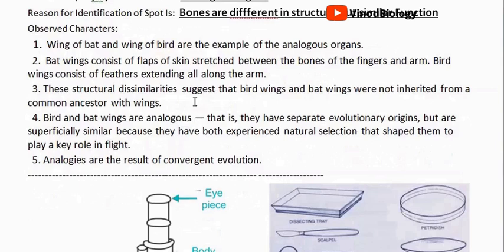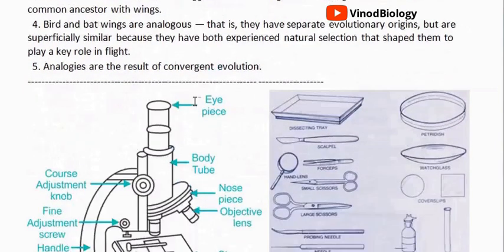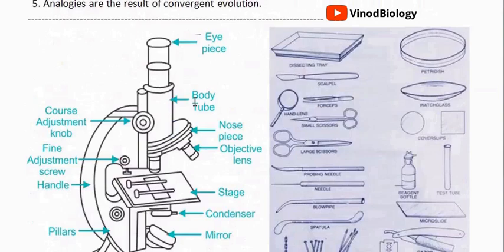The characters. Also, we should have an idea about the microscope and its parts. It will be helpful. Remember the different parts.